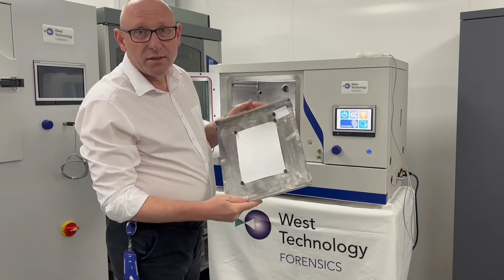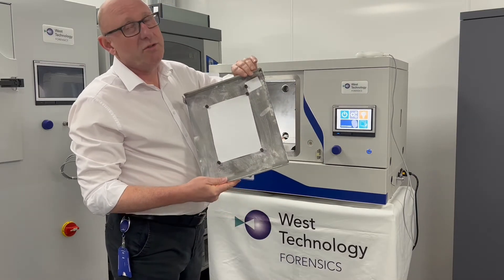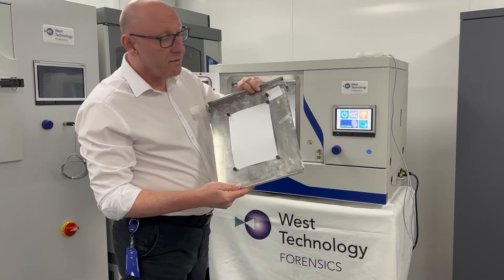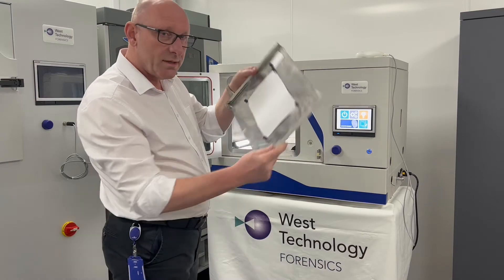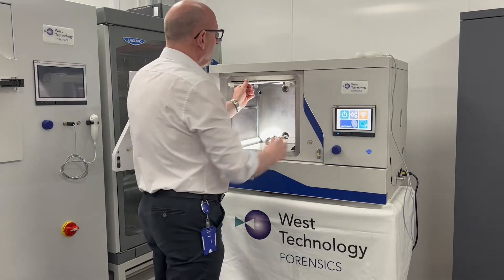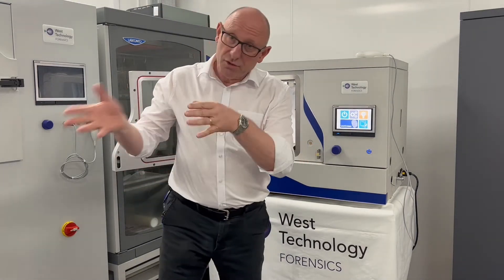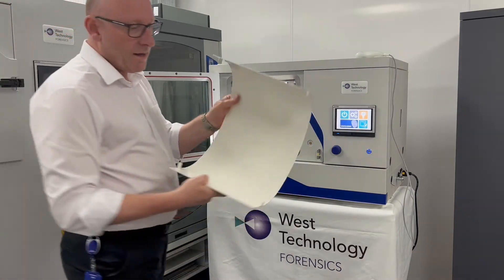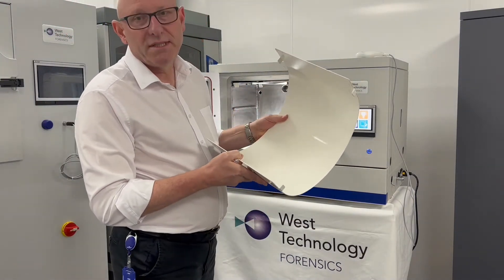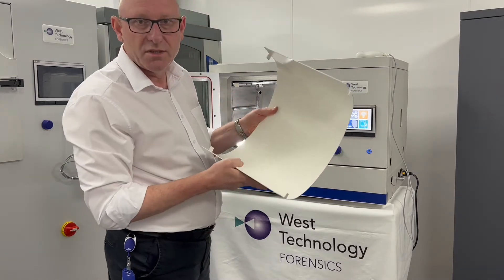We also have a control piece of paper which you should always use when doing your processing to prove that the process is working correctly. I'm going to load this back in now. We also have a curved evidence holder which we use to mount larger pieces of exhibit on the internal surface of the curved area.